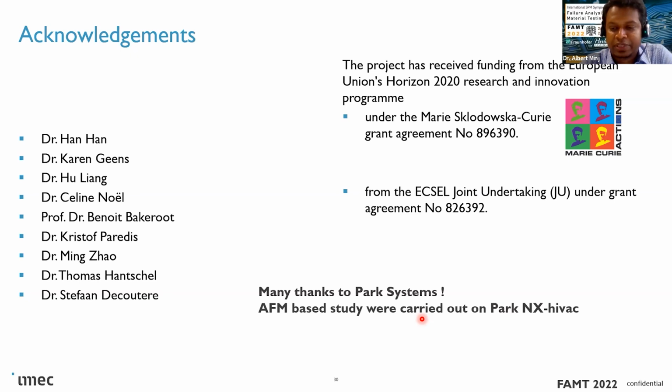For the cross section, we usually measured right after cleaving, and no polishing is necessary. Even in the polishing case, you don't need it, because once you polish it, it removes the oxide. Then you can bring it into the HiVac system after making the back contact. So we don't actually worry about the oxide formation there. Okay, thank you.